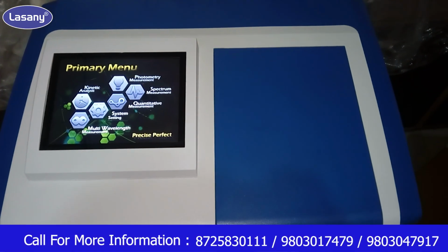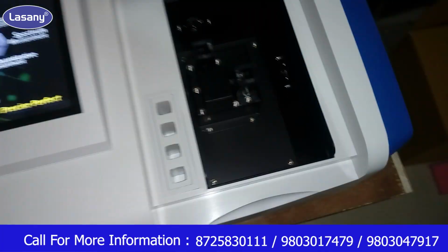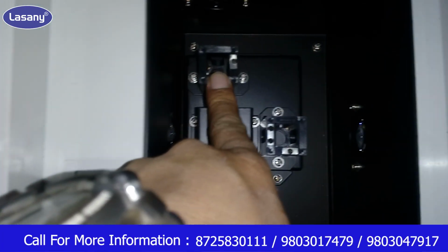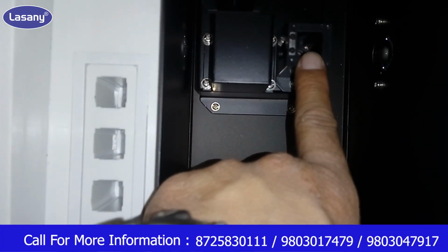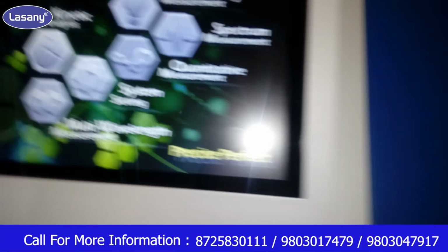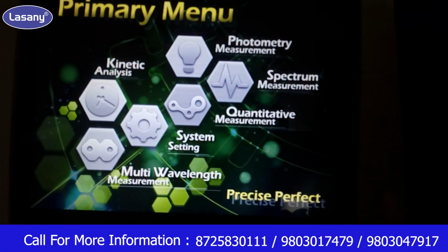This is our touchscreen double beam spectrophotometer. This is our sample compartment. This is the reference cell holder, and this is our sample cell holder. This is our main menu after switching on the instrument.